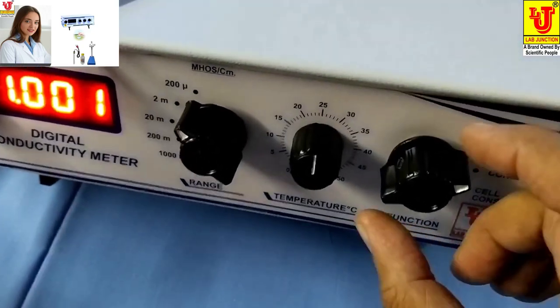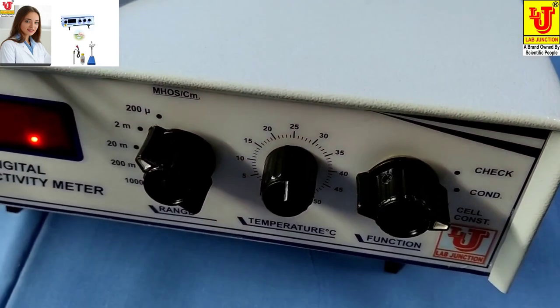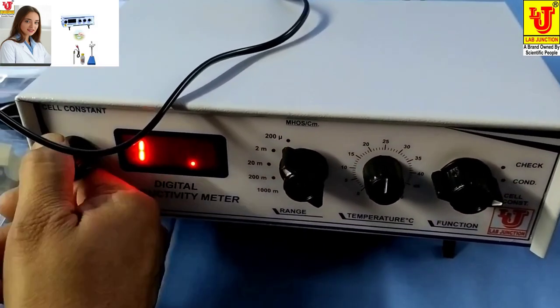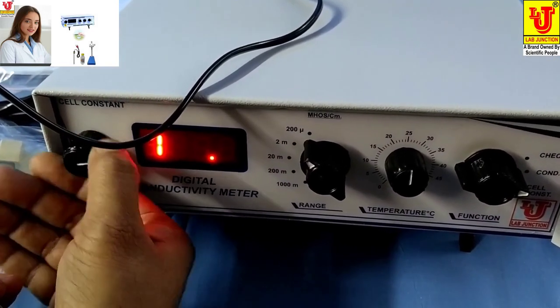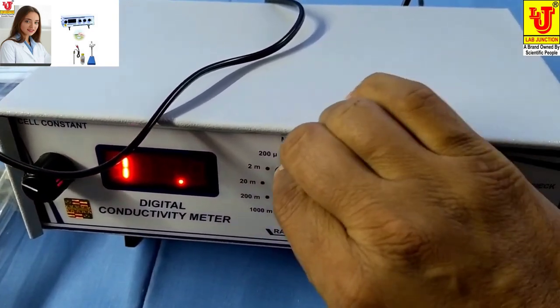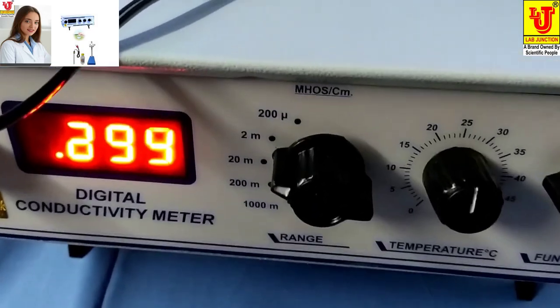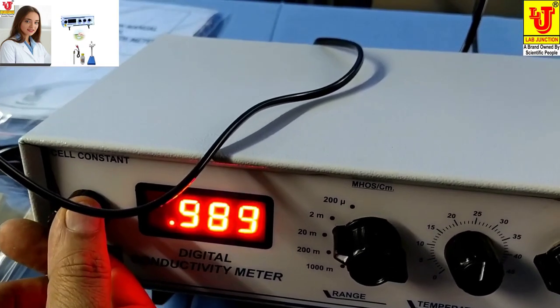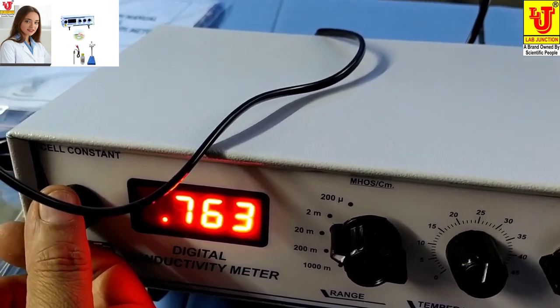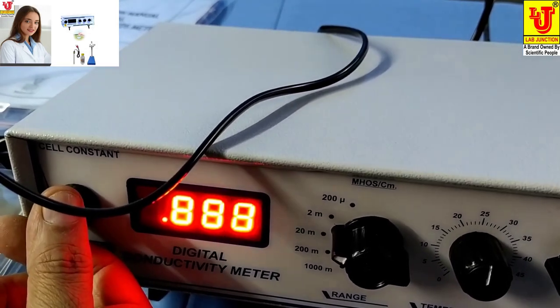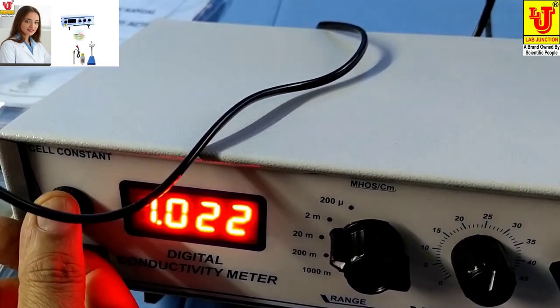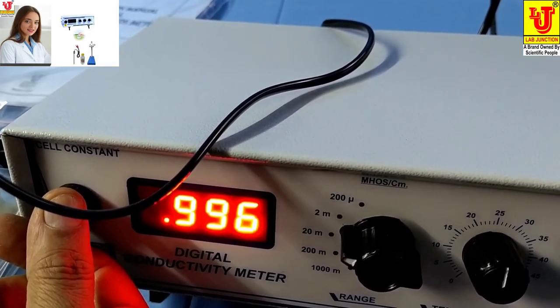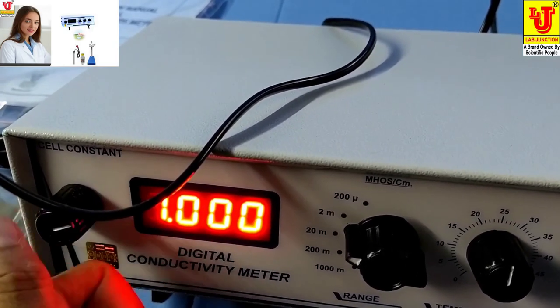Now you can set to Conductivity Position. This is our range on first position like we checked again. Now you can do on second range and set it to your known standard solution value 1 Milli. You can do on second range of decimals like this.